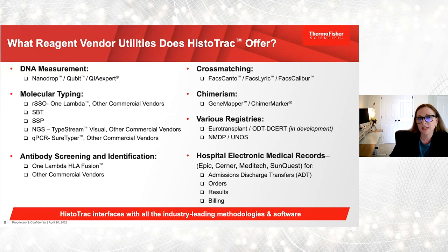Biggest takeaway for this is from a reagent vendor utility perspective, we have interfaces with all of the vendors you would see at an ASHI conference. So when you walk into the vendor hall booth, we have interfaces with all the vendors there. We do have integration with the One Lambda suite of software, but we do have interfaces with all of the other vendors.